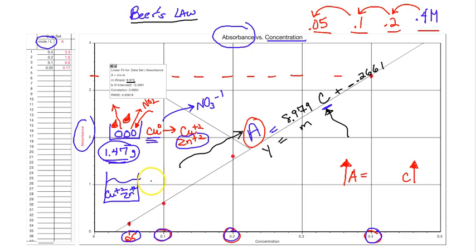Now, we poured that solution of ions and probably extra acid into a 100 milliliter volumetric flask. It's like a pumpkin with a label, but hey, there's a line. We poured this in here, and it was very dark green.